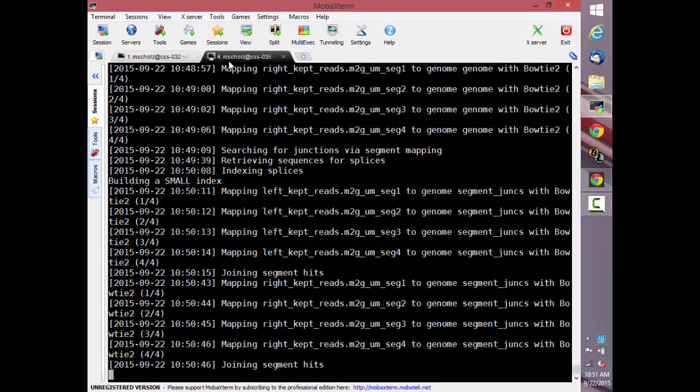Okay, since I'm still running, I'm going to work ahead a little bit by making a fake directory and doing things.